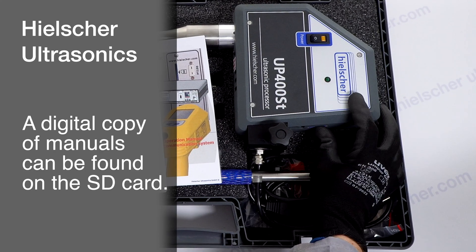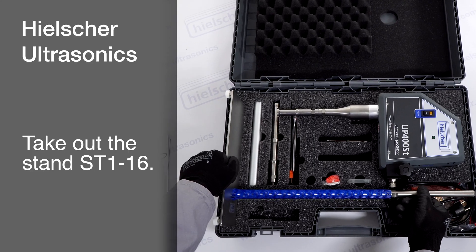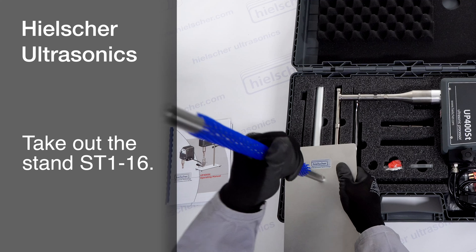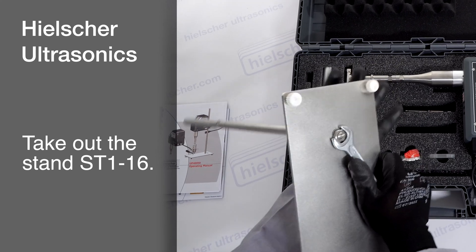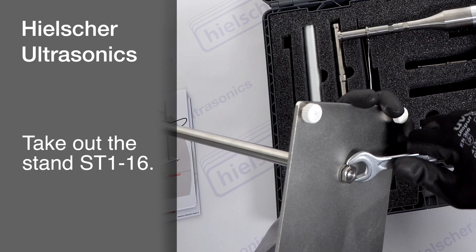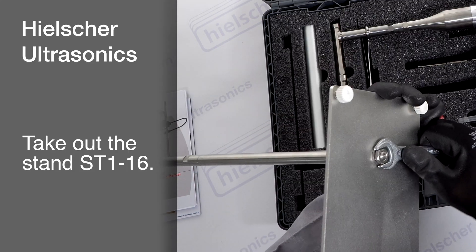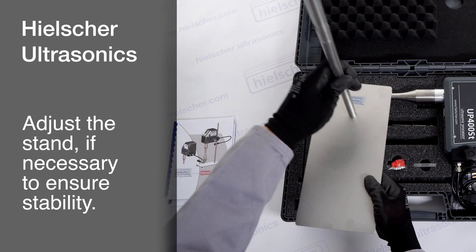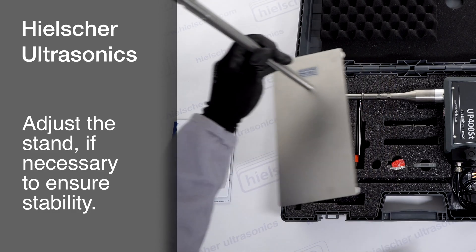Next, take out the fully assembled stand. If present, remove the protective wrapping from the stand rod. If you wish to mount or unmount the stand rod, you can do so at the base of the stand plate. The rod is secured to prevent rotation. Adjust the feet of the stand if necessary to ensure stability, particularly on uneven surfaces.